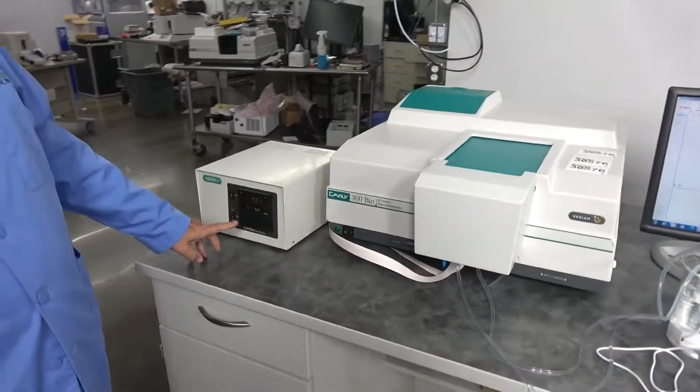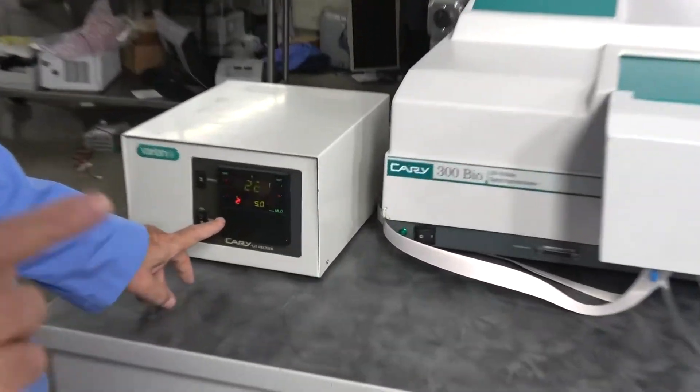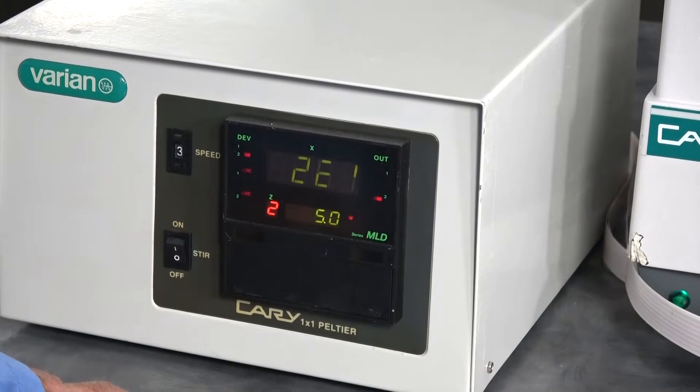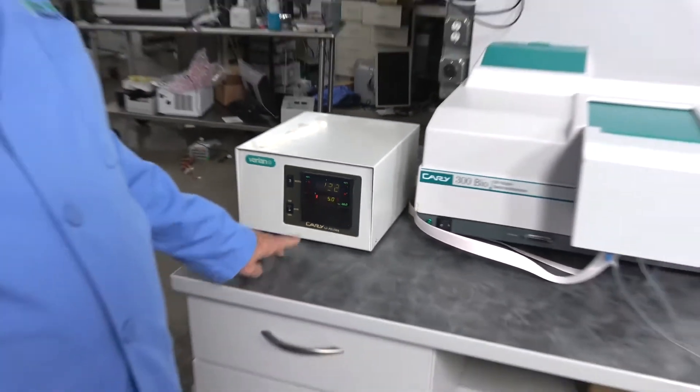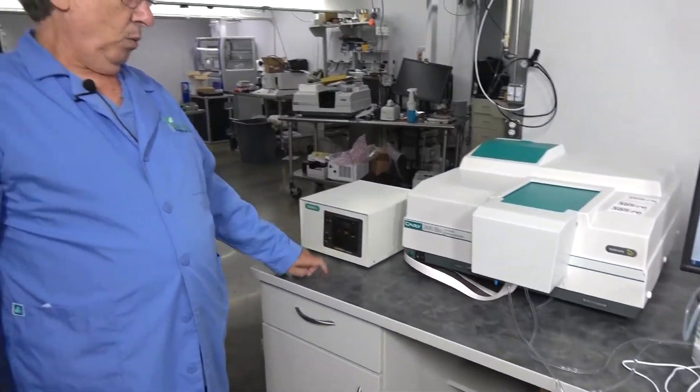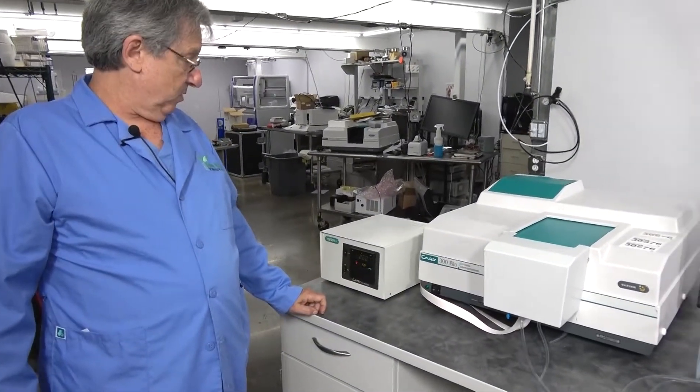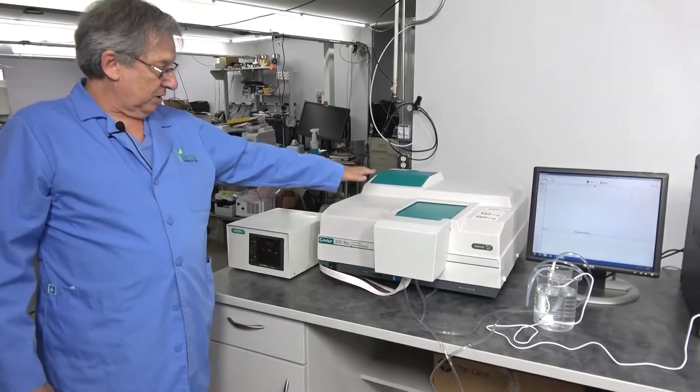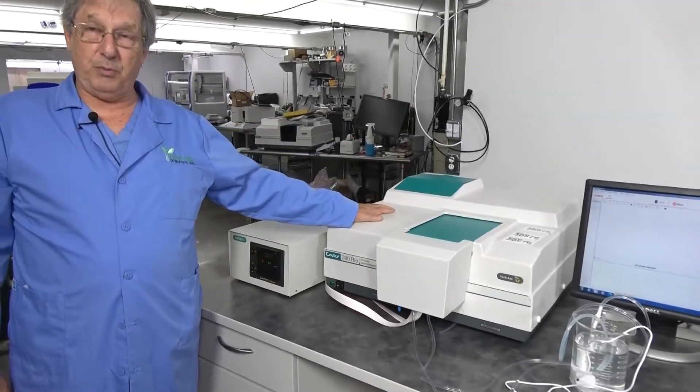When you do set the settings in the software, it does send out to the controller as well. You can also set the controller manually with this device. That leads to one of our other accessories. This, by the way, was hooked up to a Cary 300.